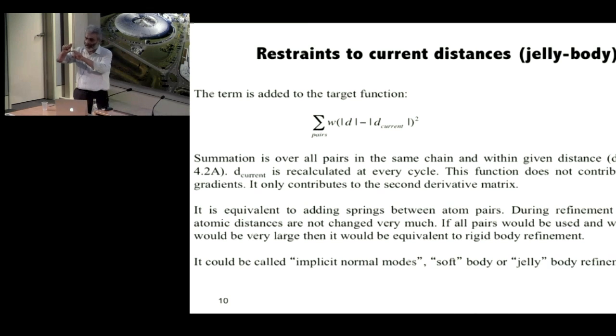At the end, atoms close to each other move in concerted fashion. If they move in concerted fashion, it means that you can have a flow of molecules, but local conformations will be kept intact.